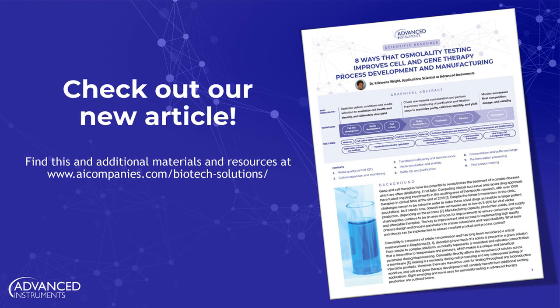Another question that just came up. Can osmolality be used to detect low-lying infections in cultured media early on?